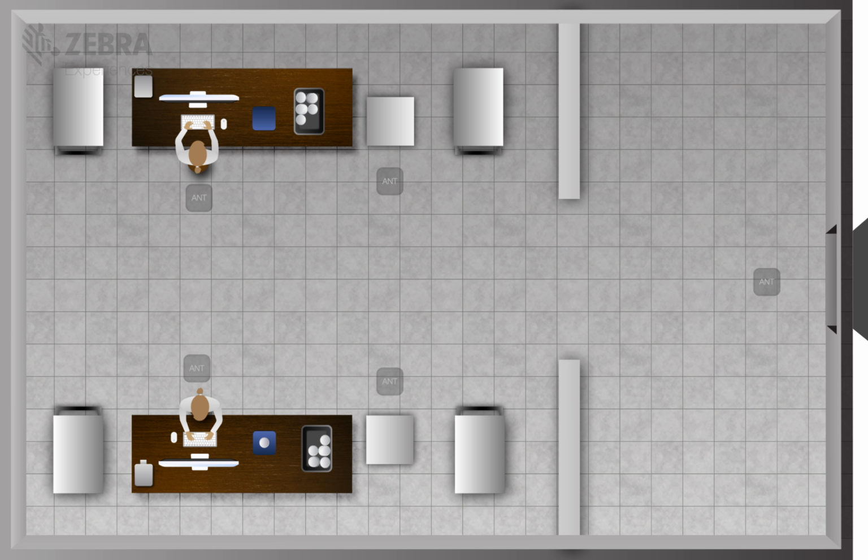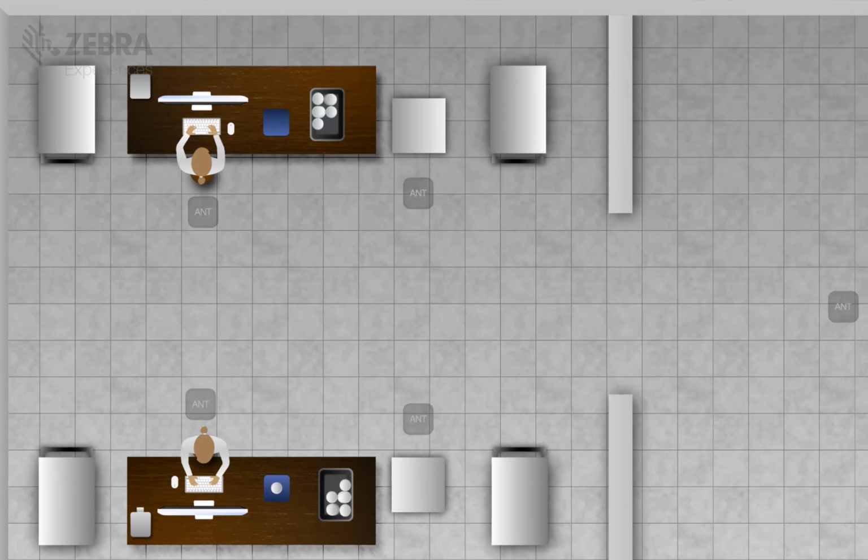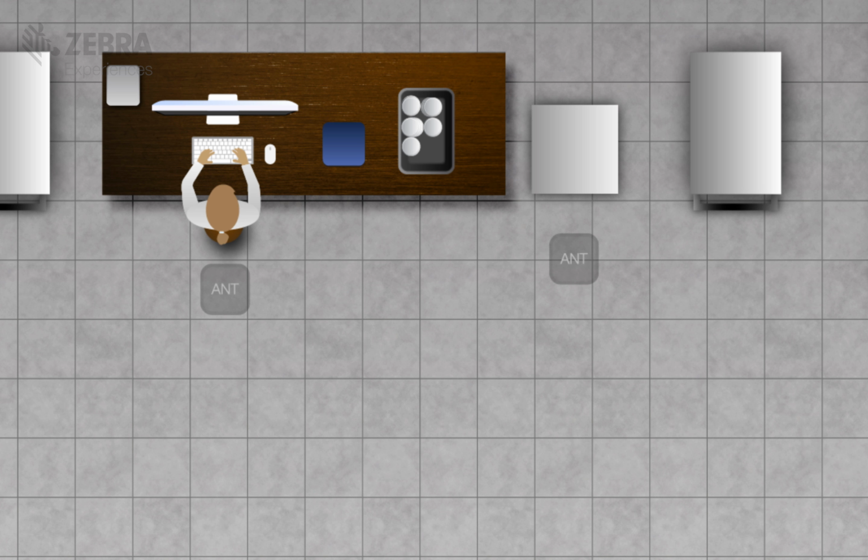In the culture tracking process, we start our story with a cart full of cultures that have been delivered to the ID station where Petri dishes receive their tracking tags. Above the ID station is an antenna to identify the operator giving these cultures an ID. The operator is provided with a PC running the Identity Station application with an RFID printer and scanning pad.